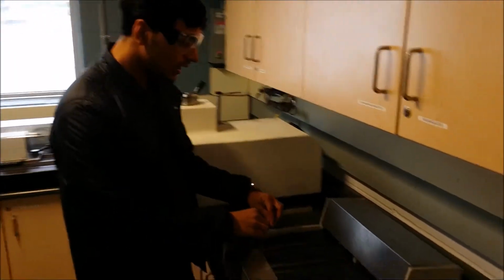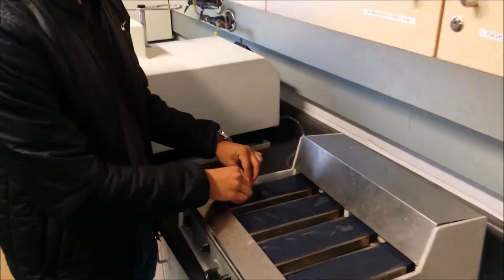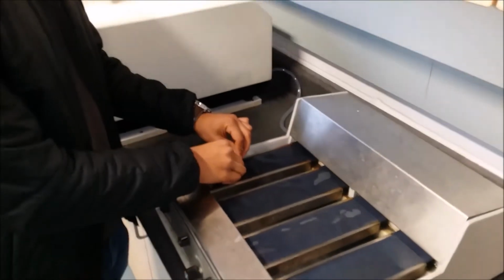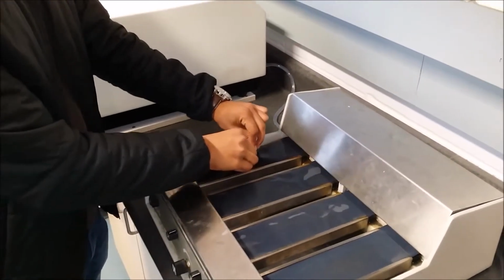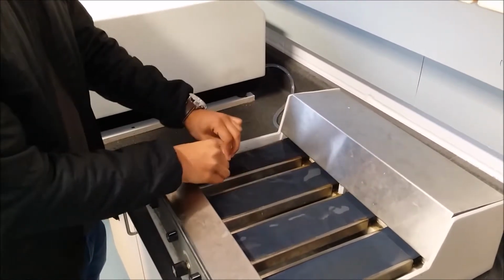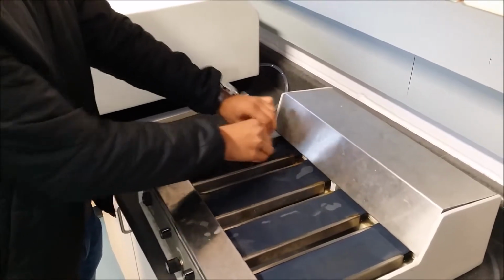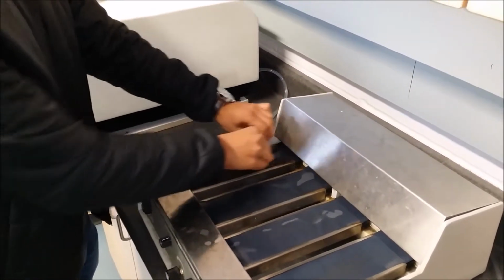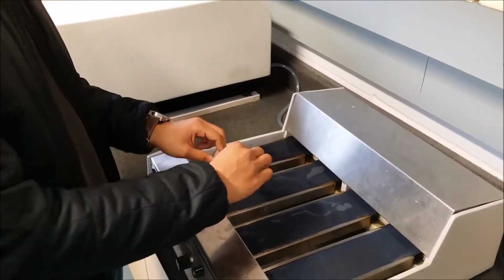We're going to start at about a 45 degree angle so that we can remove more debris from the surface, applying uniform pressure on both sides so we can have a good grinding. Just small strokes, applying uniform pressure on both sides. Small time at the coarser ones and more toward the end, at the finest.